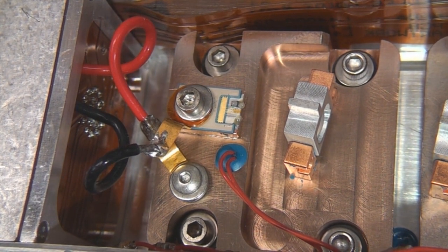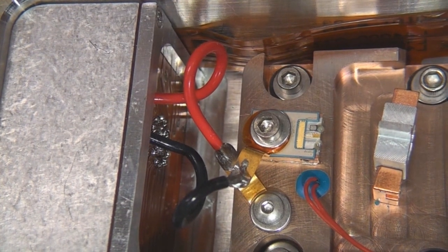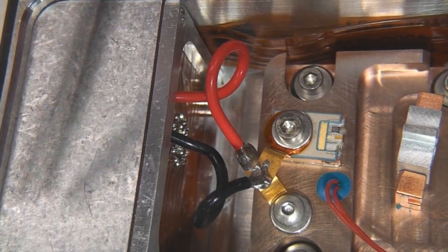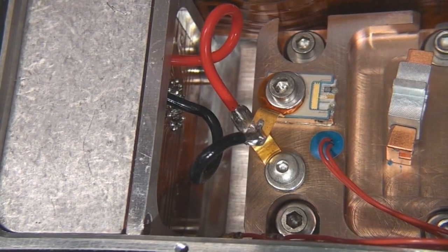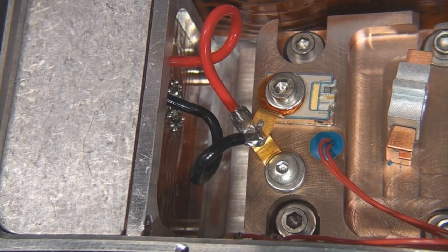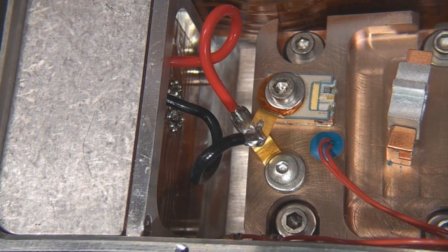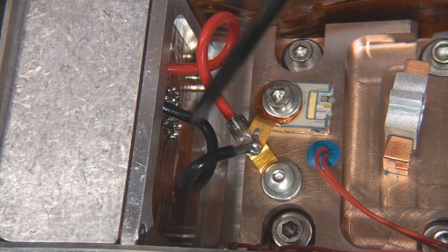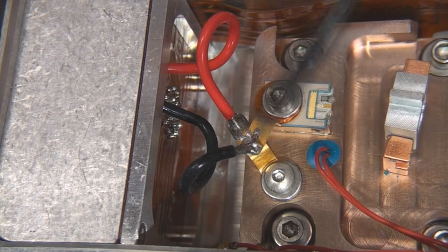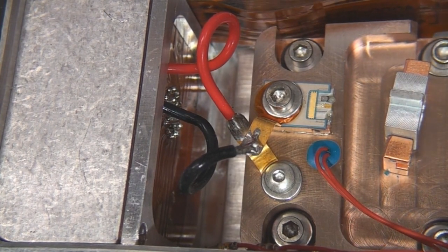But one thing I was wondering, there is actually quite a lot of space in here, and knowing that these diodes are quite fragile, I was wondering maybe there's actually a relay in here that shorts the laser diode when there's no power. I've not really looked inside too many of these, but the fact that it was reading dead short with no obvious physical damage suggested that might be the case. So I unsoldered one of the pins and measured across, and yes, these two wires measure dead short, but the actual diode itself measures plausible for a diode. So clearly there is a relay in there.